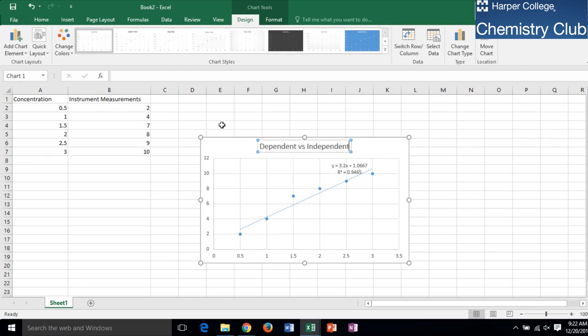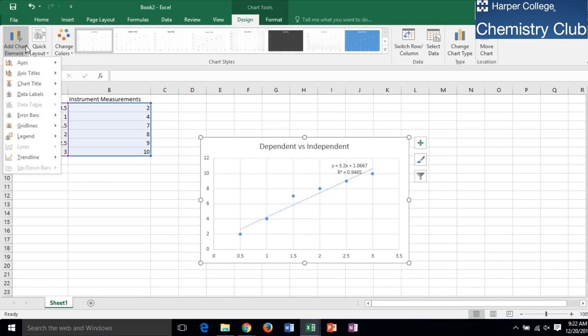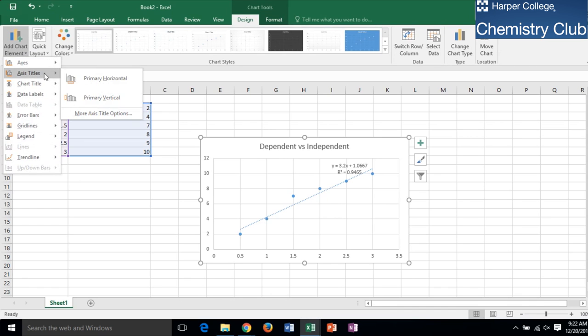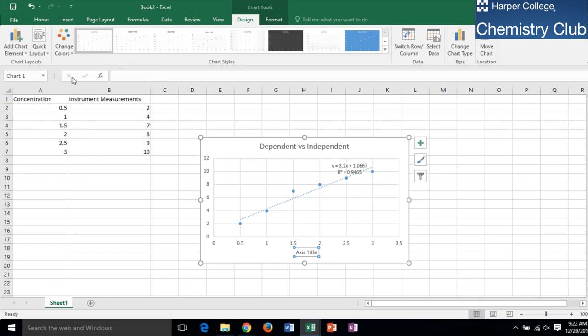Enter the axis title for the independent variable.